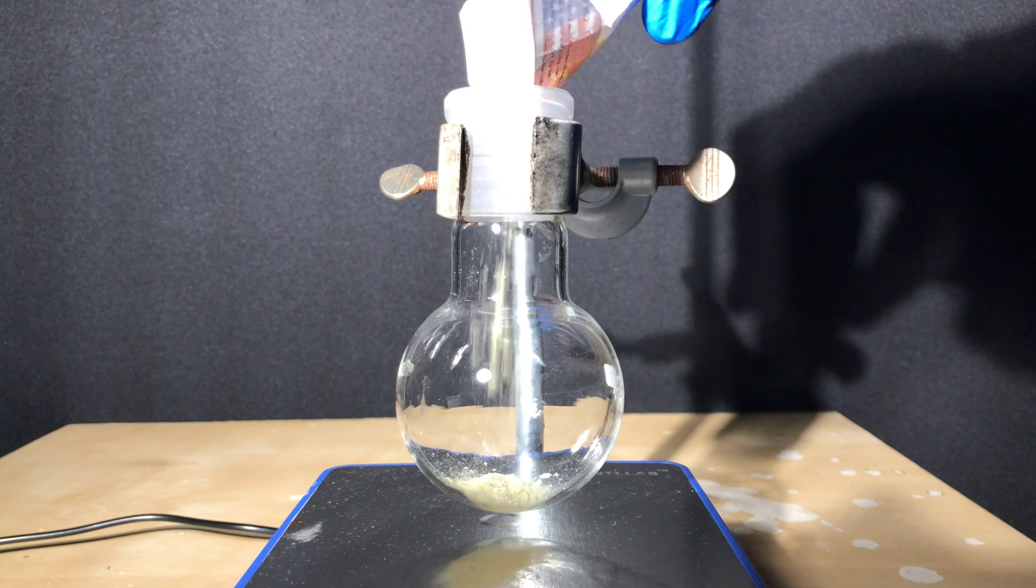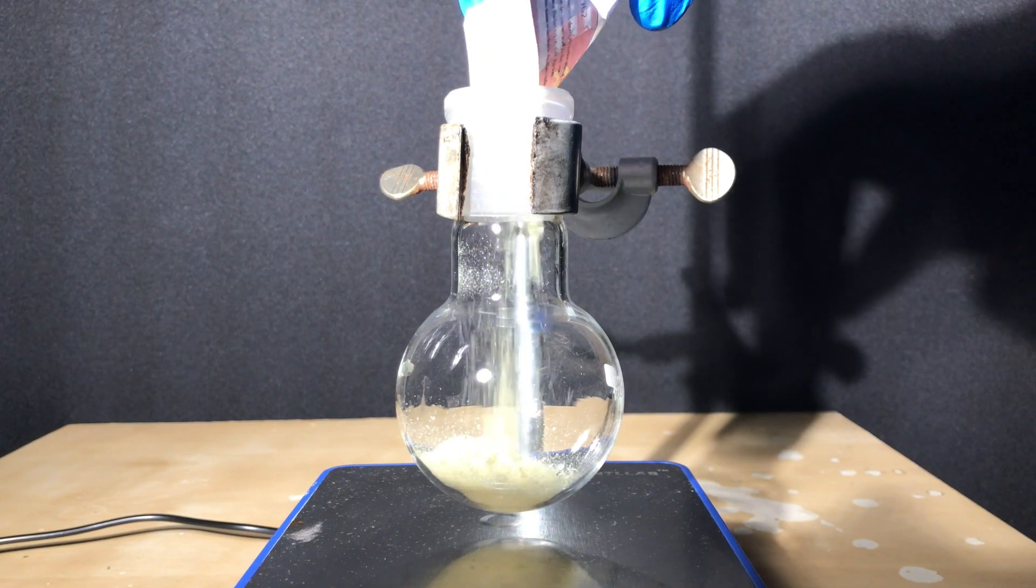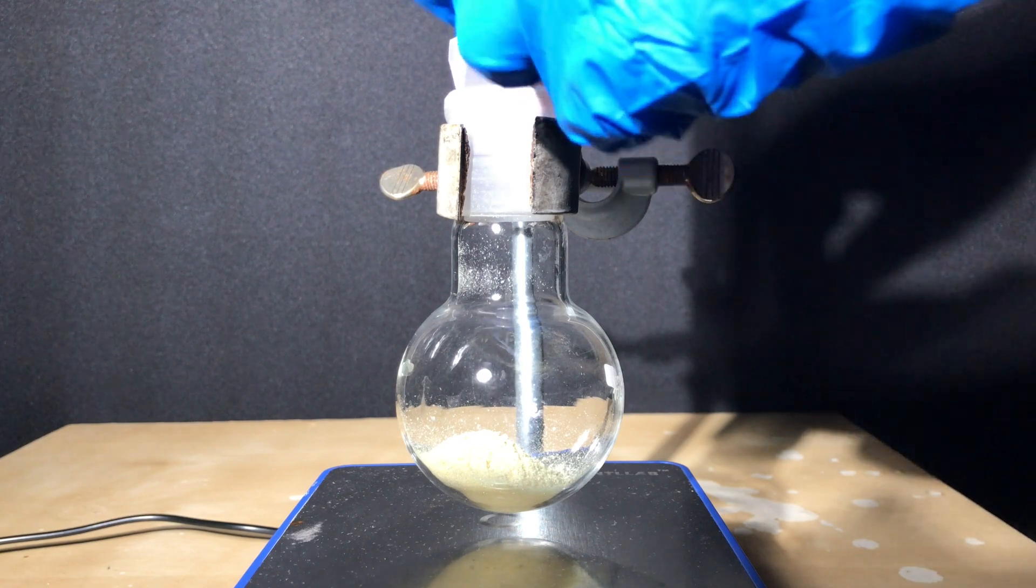The Anthracene and the stir fish were added to this small round bottom flask followed by about 50ml of DCM as a solvent.